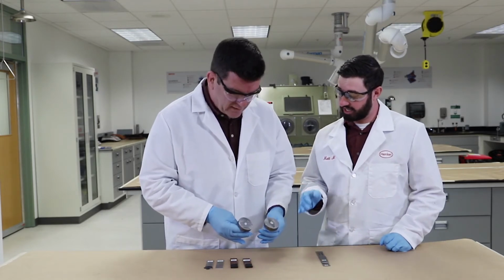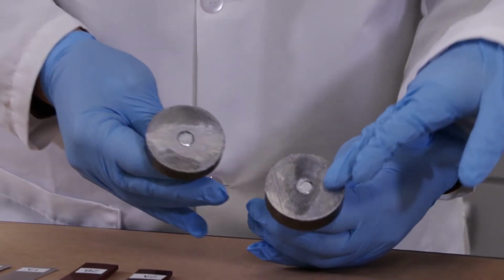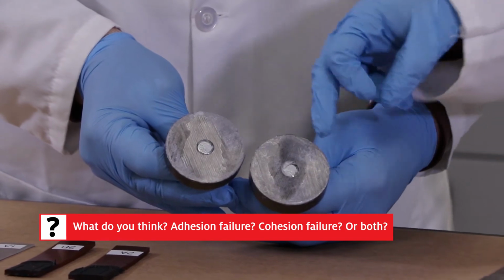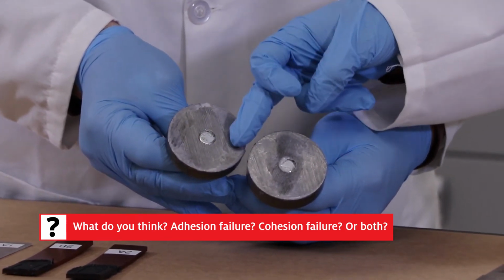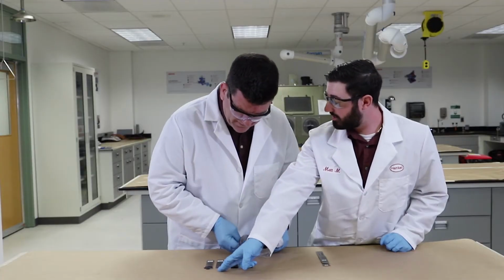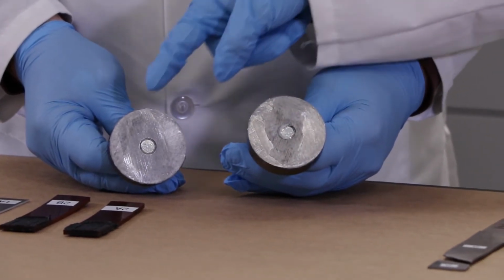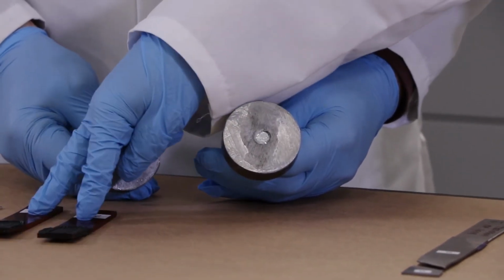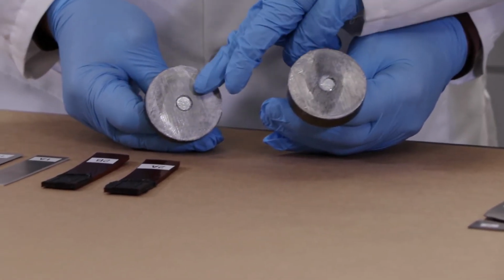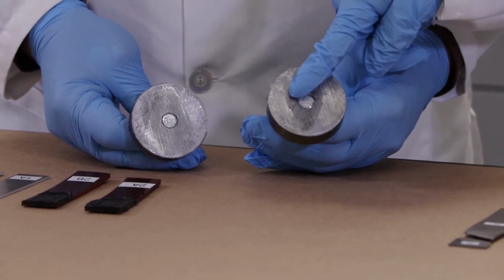So the key thing to look at here is how it adhered to the surface. So we're seeing here there's the metal. So the adhesive did not stick here on this side of the metal, and on the other side, here there actually is the adhesive. So it stuck to this surface, but not this surface. So just like we had here, there's adhesive on one surface, but not the other. So even though we have product on both surfaces, like we had here, they fit together like a puzzle because it didn't stick here, but it did stick there. And conversely, it didn't stick here, but it stuck there.